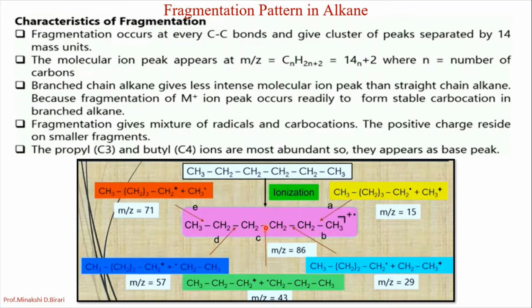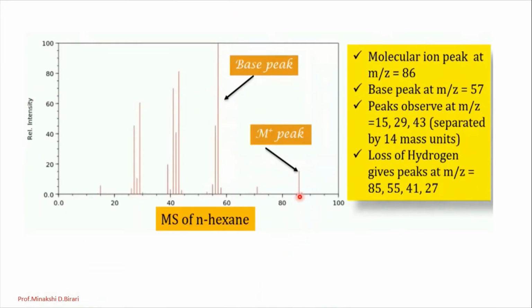So let's see the mass spectrum of hexane. This one is the mass spectrum of n-hexane.